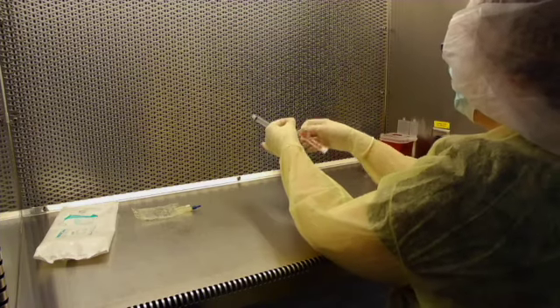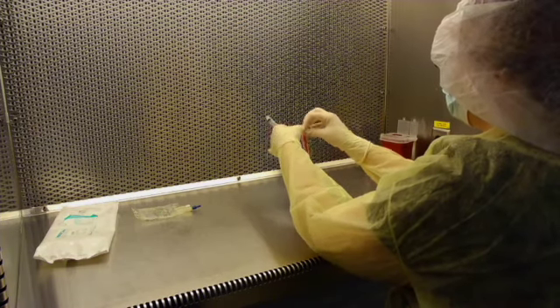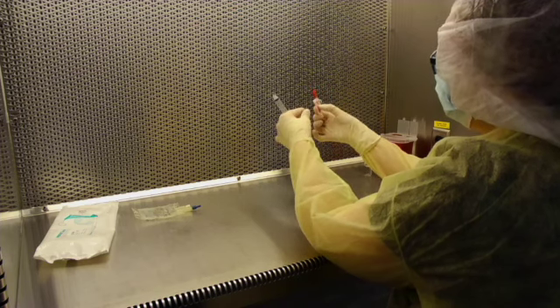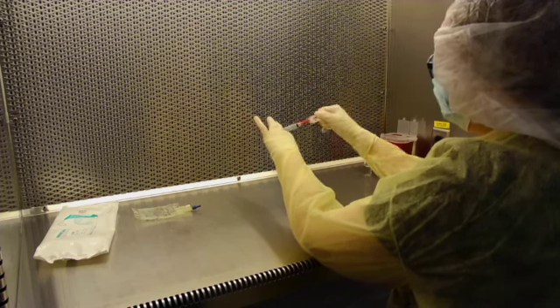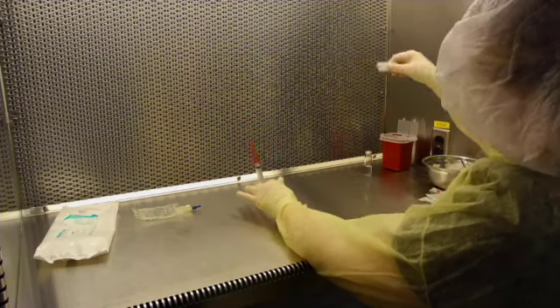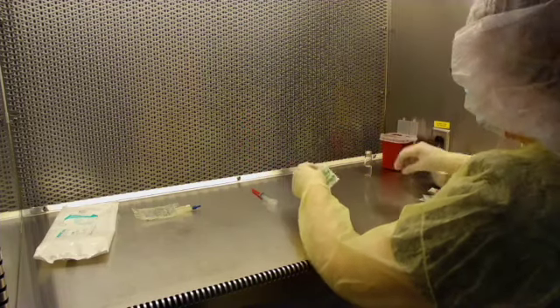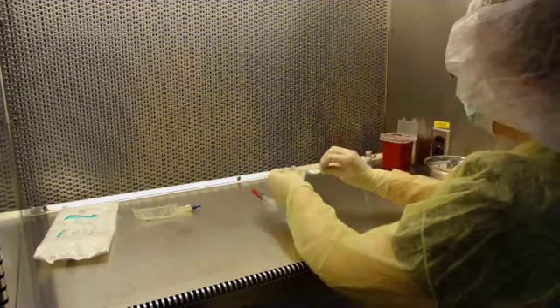Bring your needle into the DCA, opening it to expose the hub. Make sure to butterfly the wrapper and thread it onto the luer lock of your syringe. Righty-tighty, and dispose of garbage. Open up your alcohol swab now for your needle cap and place it on your preferred side.